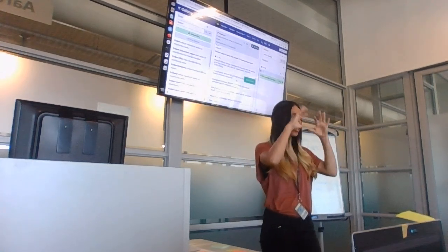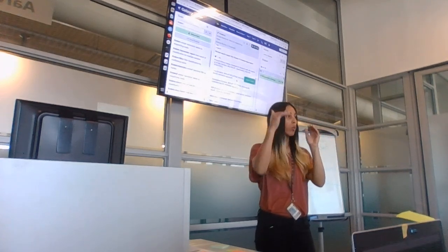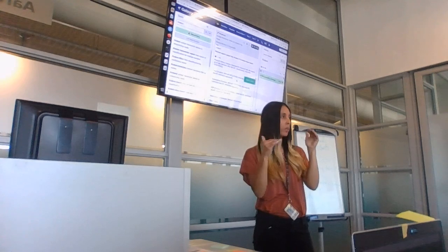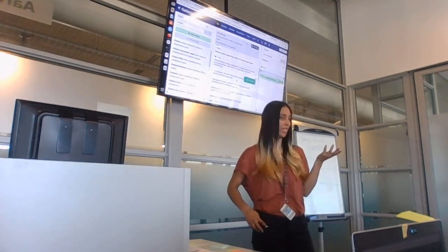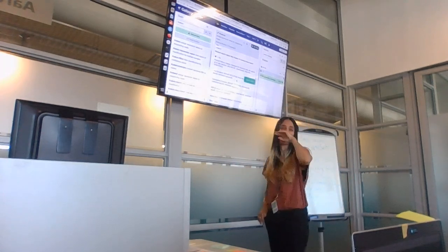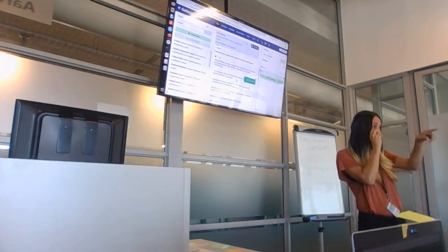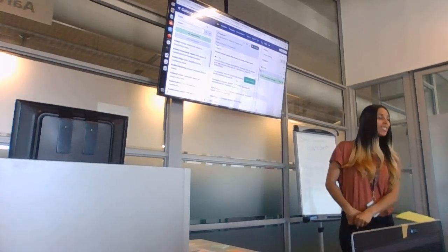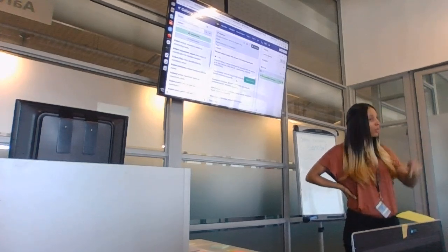It's going to go, these are databases full of sequences like BLAST. We're going to check what your sequence is closely related to, and we're going to tell you what species this is. I didn't explain what Kraken does. Yeah, that was my own fault, sorry. But you of all people should know because we ran Kraken on your contaminated data set. That was you.